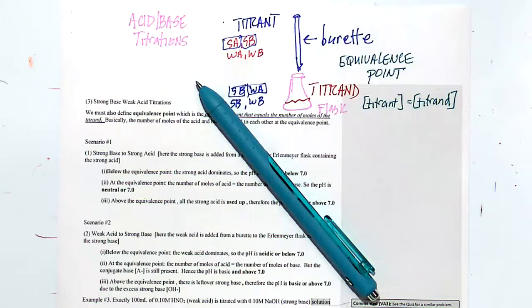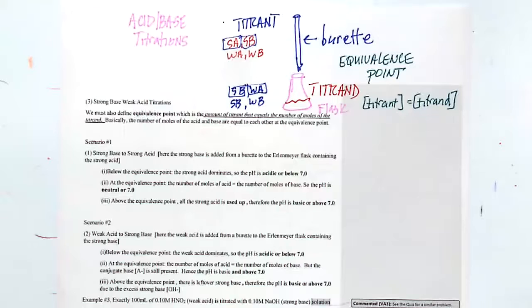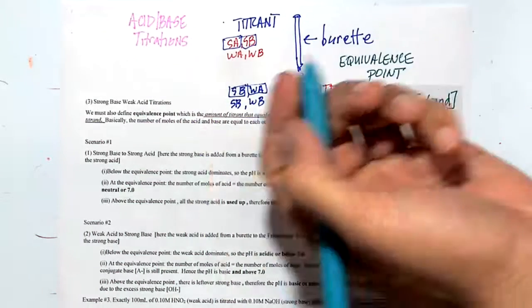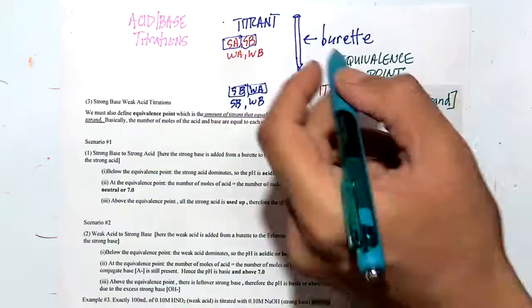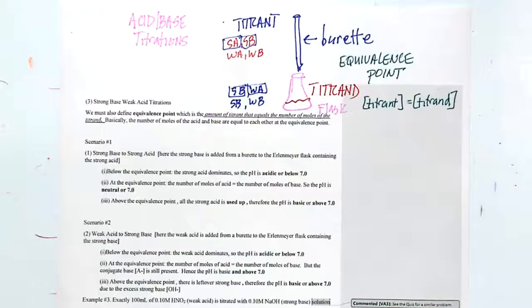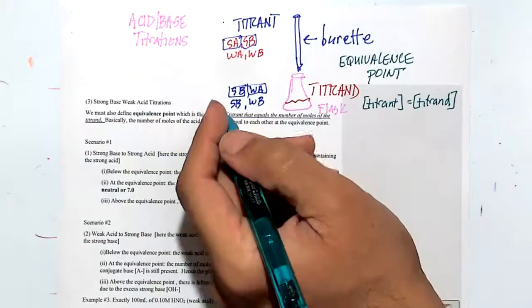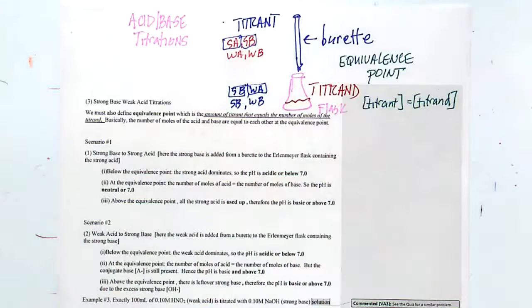Another thing is you can read this to 2 decimal places. Actually, you read this to 3 decimal places. I'm sorry. If you take analytical chemistry taught by Dr. Hooper, you'll know more about the accuracy. You can read this to 3 decimal places.